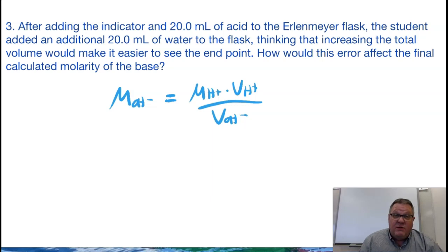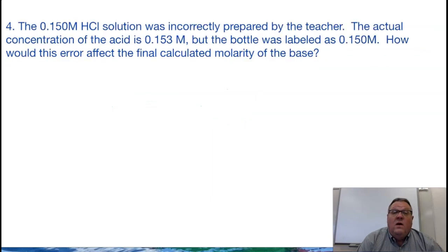Okay, is anybody 3 for 3 yet? See if you can go 5 for 5 here. Okay, this one actually happened a couple years ago. I made up the solutions. But anyway, pause the video, see if you can find the error, if there is one, and see if you can predict how that error will affect your calculated MOH minus.